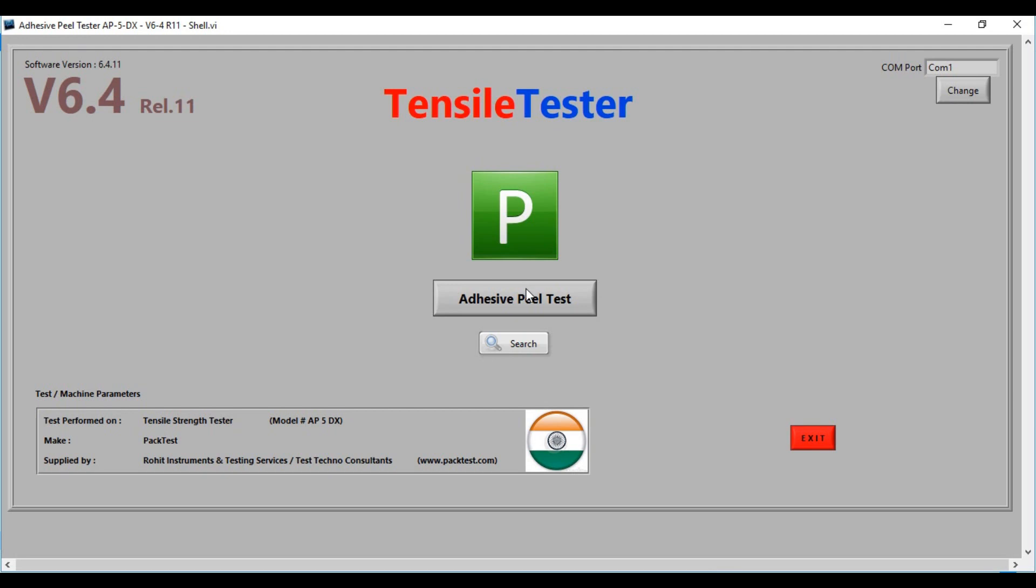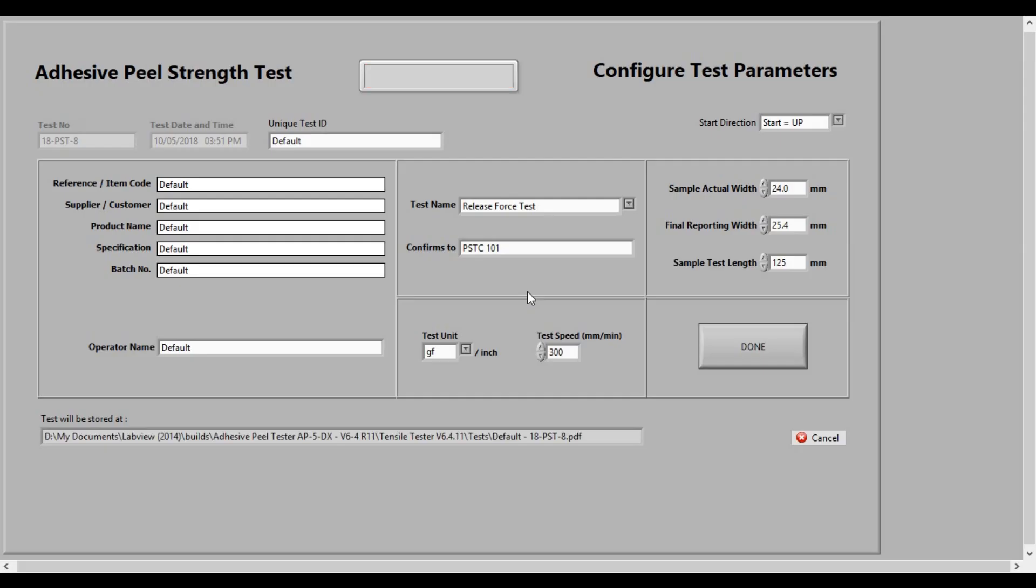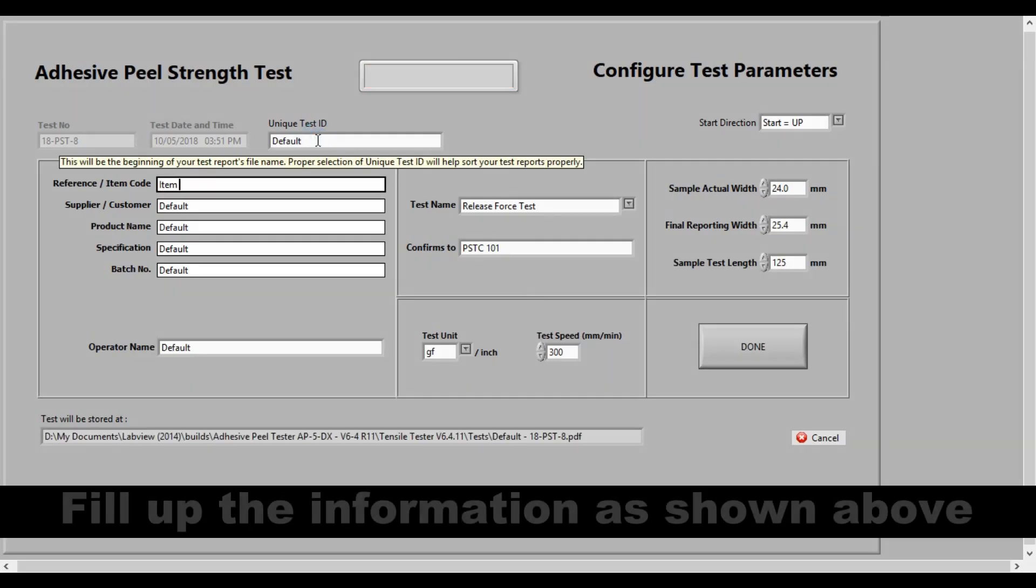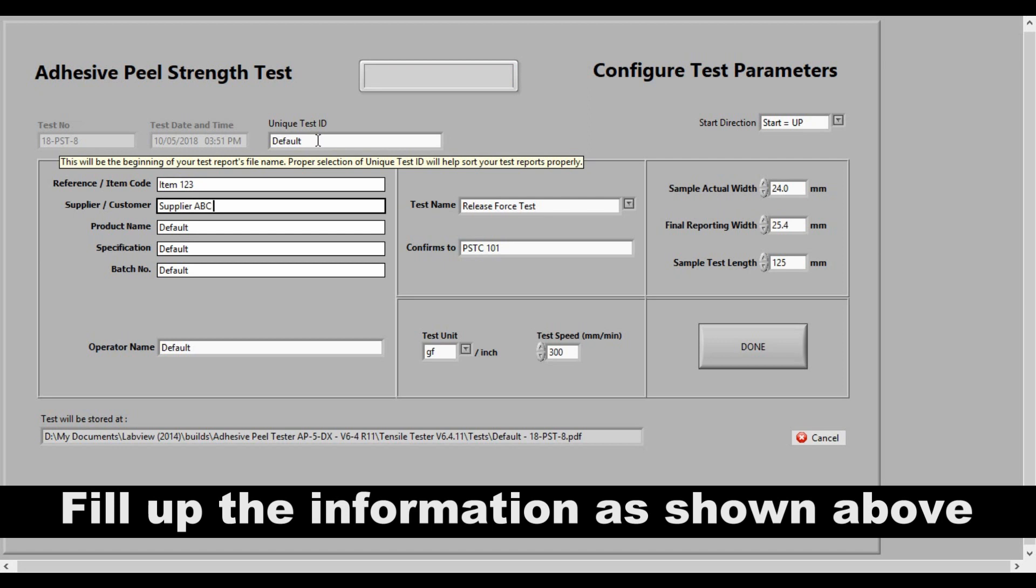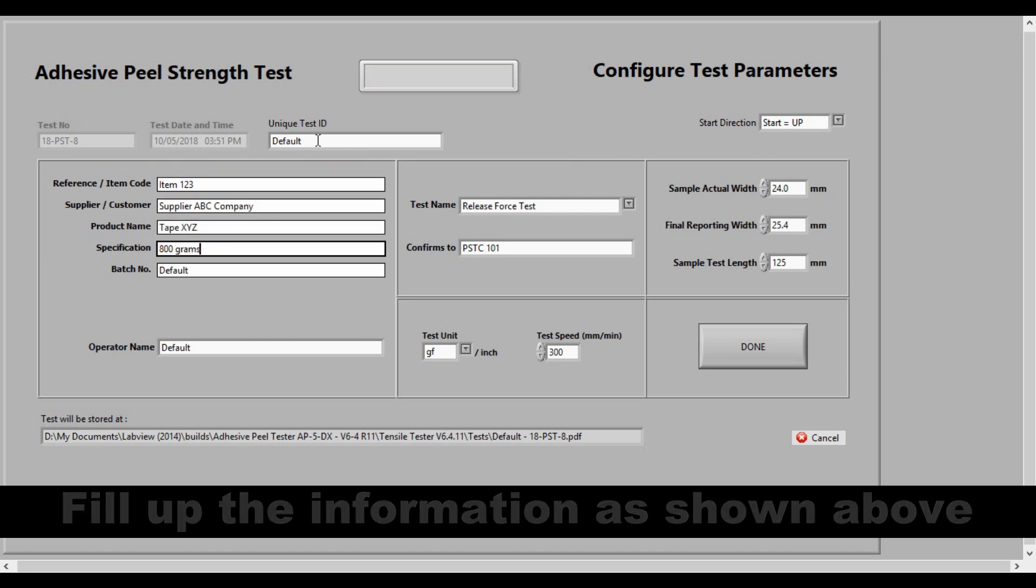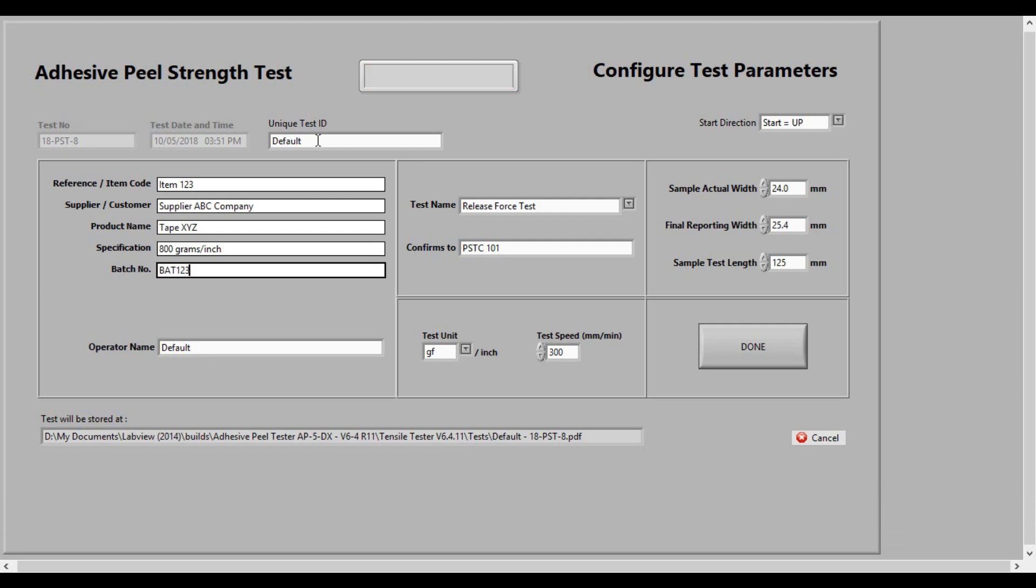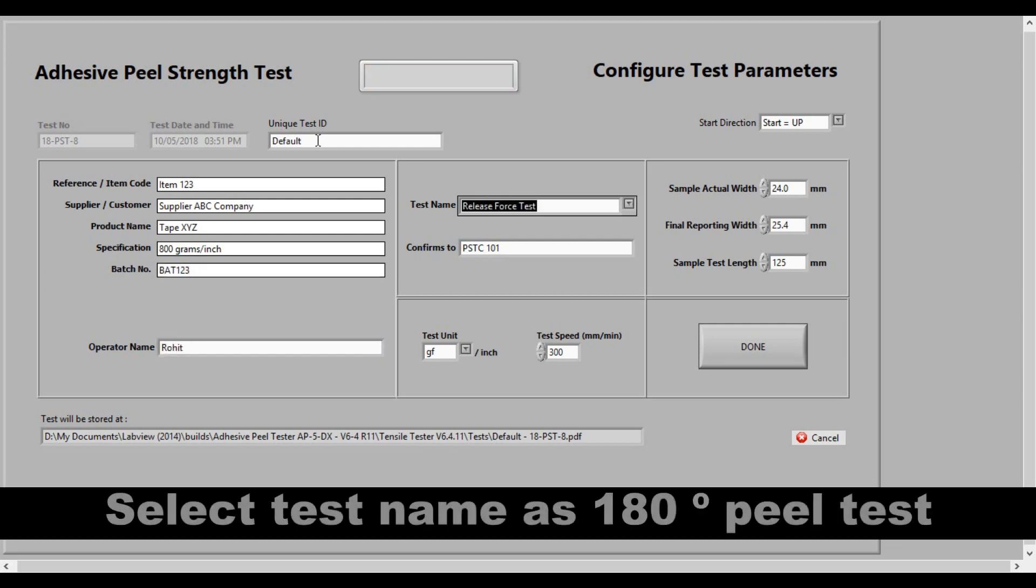Start the software and click on adhesive peel test. Fill up the information as shown above. Select test name as 180 degree peel test.